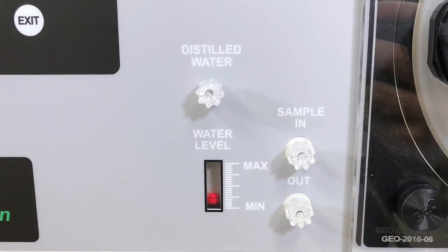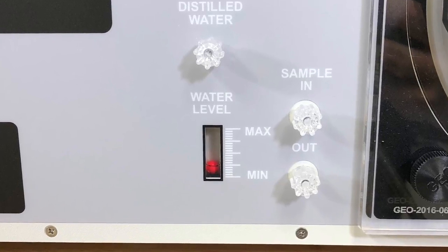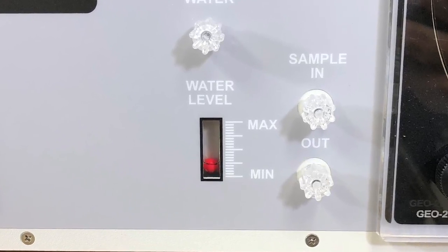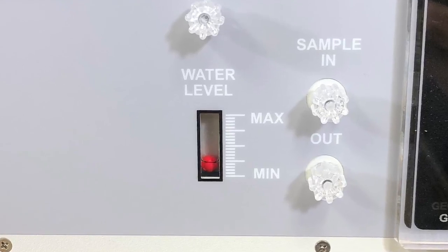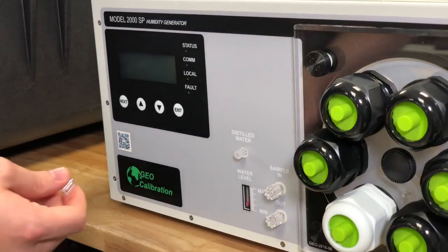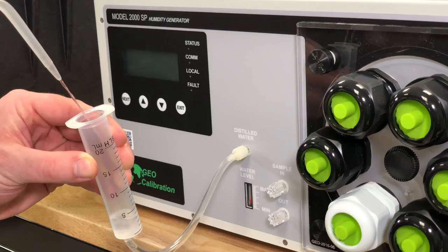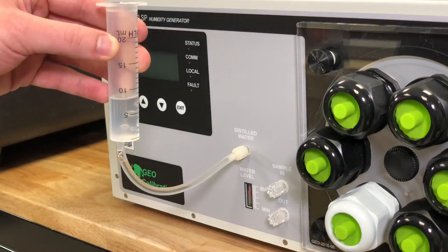Before we do anything else, we have to examine the fill port and the fill level indicator. You'll notice that this fill indicator is on empty. That's because we completely empty the reservoir of all units prior to shipping. It is mandatory that you now fill the unit with water. Running the unit dry will result in a burned out saturator. To fill the unit, first remove the fill cap. Using the provided fill tube, add 150 milliliters of distilled water into the internal reservoir.